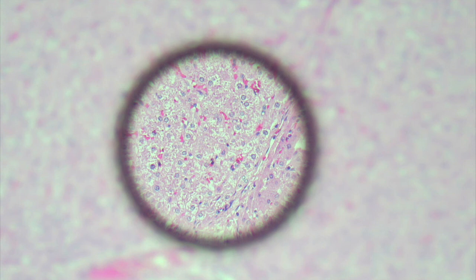But for either a research or a diagnostic application, if you're looking to photograph a field of interest, you don't want there to be a large bubble present there. So this is an example of where you simply take your wooden applicator stick or a dry pair of forceps and squeeze on the top of the cover slip until you've chased the air bubble out to the edges while the mounting medium is still reasonably wet.